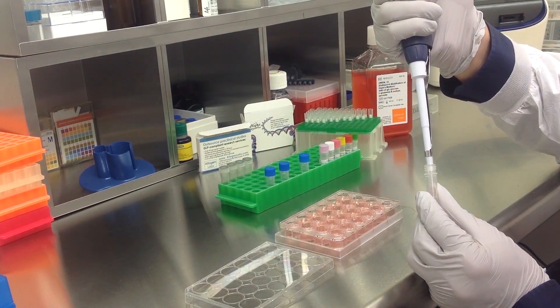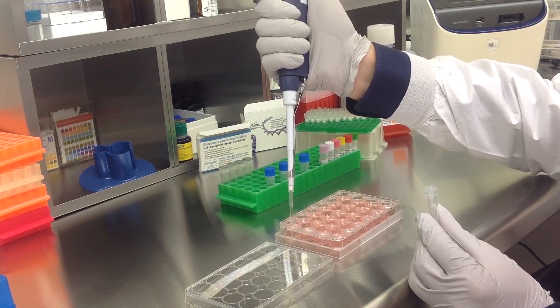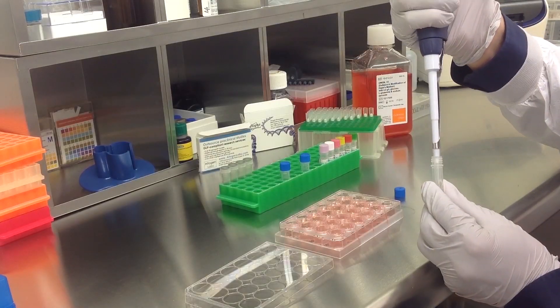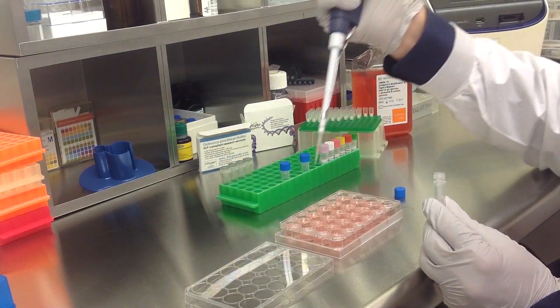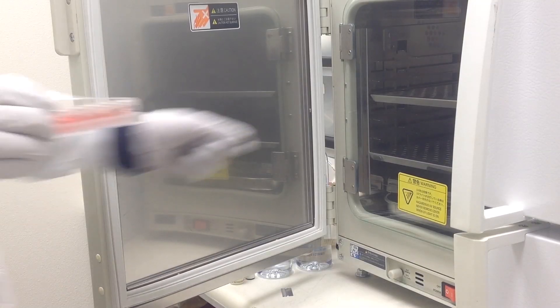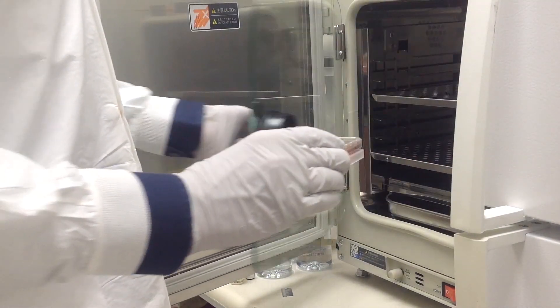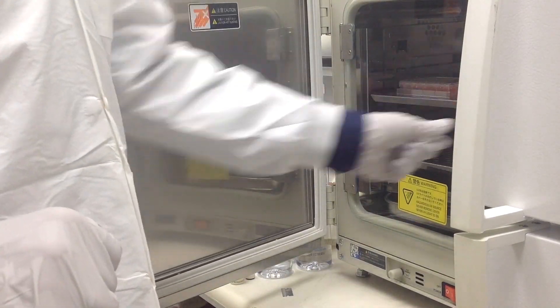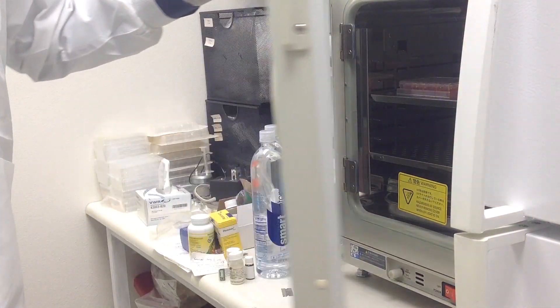Add the prepared transfection complexes to the 500 microliters of complete growth medium. Once you have treated all appropriate samples, incubate the cells at 37 degrees Celsius in a humidified carbon dioxide incubator. Assay for phenotype or target gene expression 48 to 72 hours post-transfection.